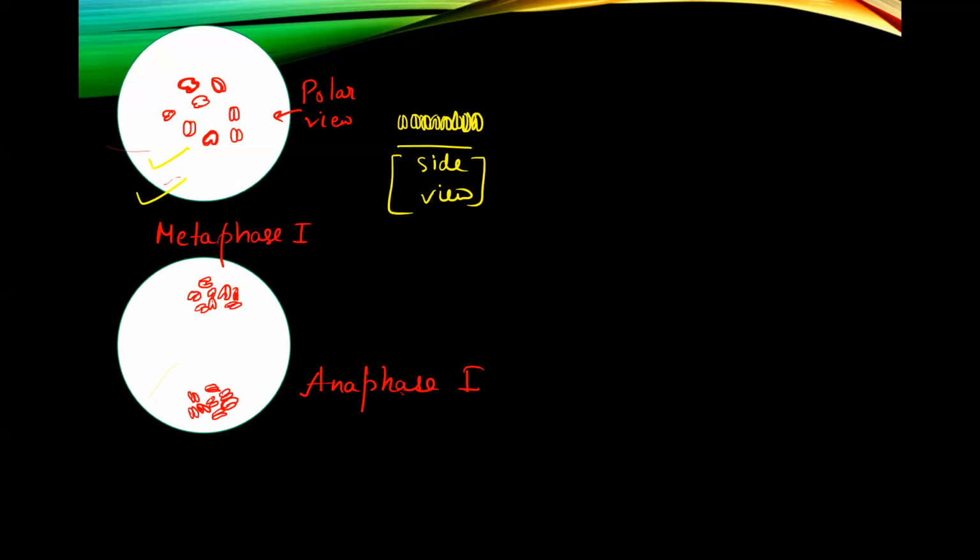Fine, it looks like this in side view. Next, we come to Telophase one.